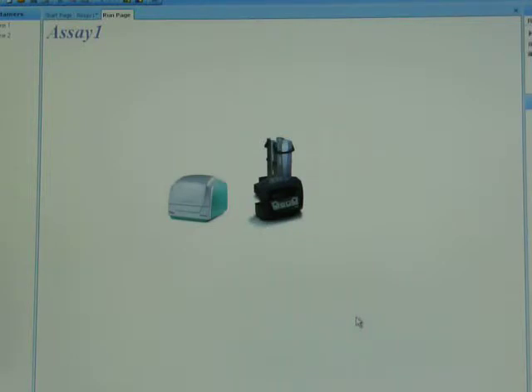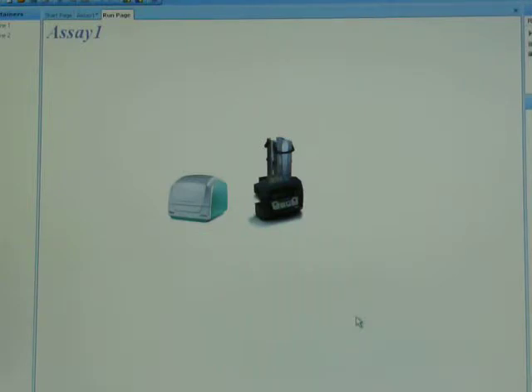You'll see that on the screen we have actual icons of the instruments. We have the VarioScan on the left and the RapidStack in the center. The Polara RS software is going to tell you what it's doing at all times.